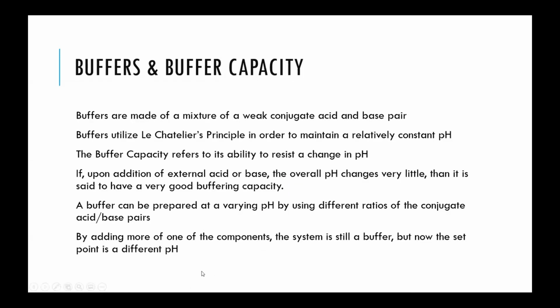Buffers themselves are a mixture of conjugate acid-base pairs.